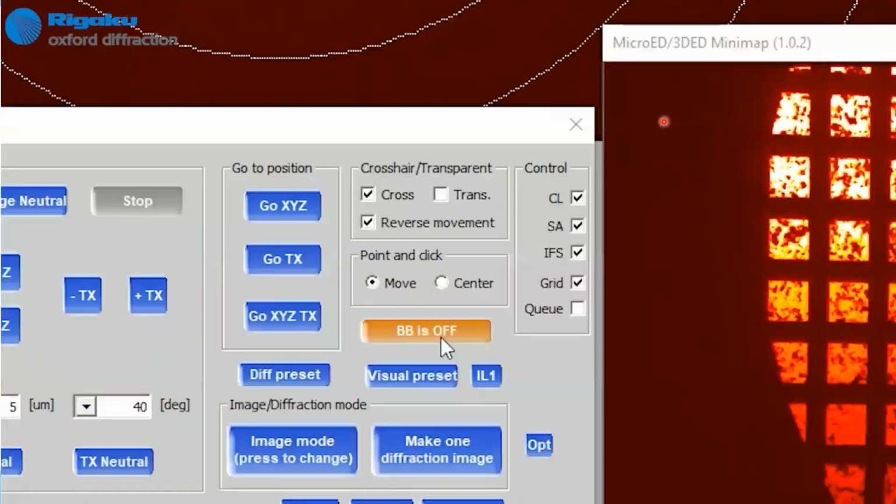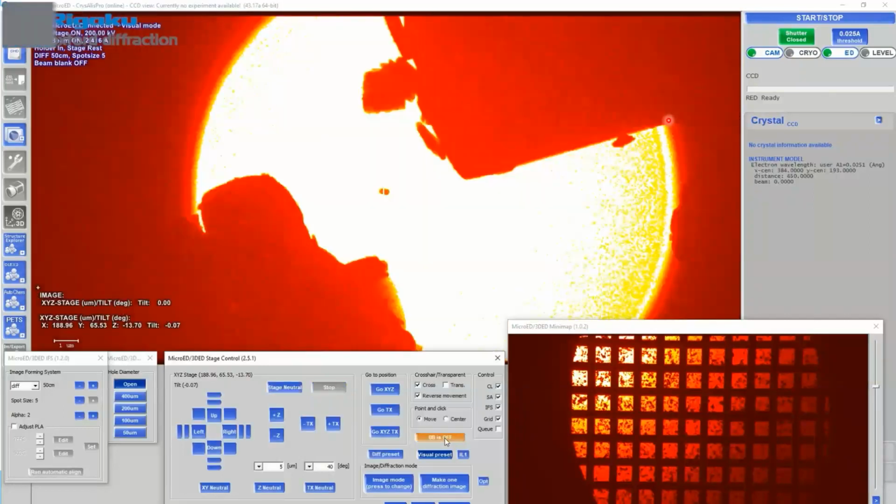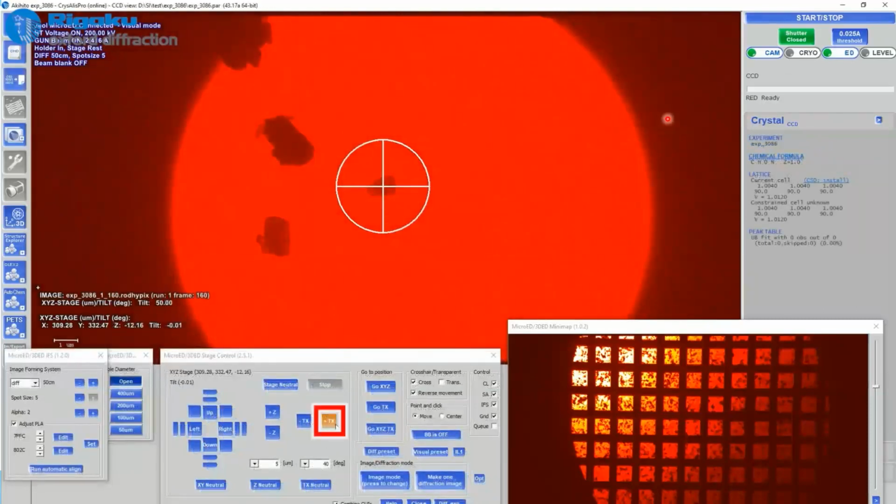There's only one electromagnetic lens in which the current needs to be slightly changed to switch between those two modes. It's a very straightforward process without any sizable hysteresis.